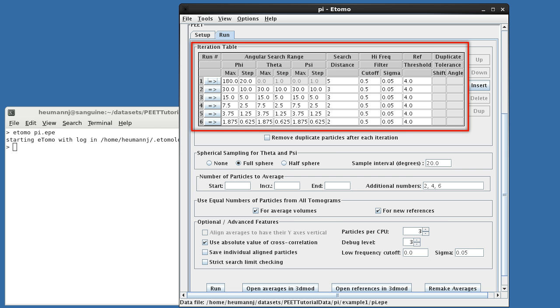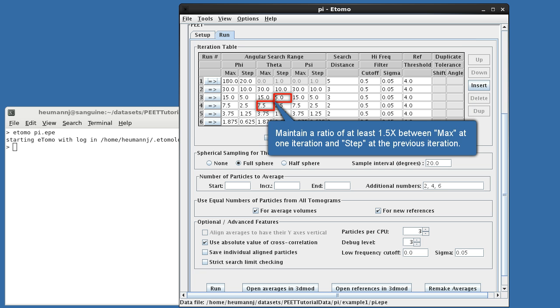Appropriate values are dependent on the specific dataset, but we can give some general guidelines. For the moment, let's skip over the first iteration, and concentrate on the middle of the table, where these patterns are more applicable and more apparent. First, for each of the three angles, the value of max at a given iteration should be at least one and a half times that of step at the previous iteration. This ensures that an apparent peak found at one iteration will not be lost at the following one.